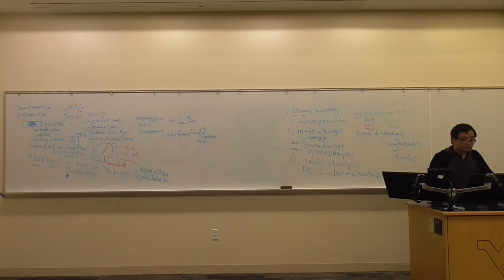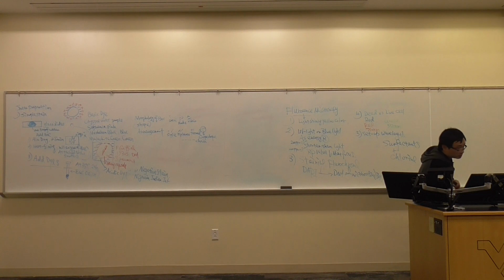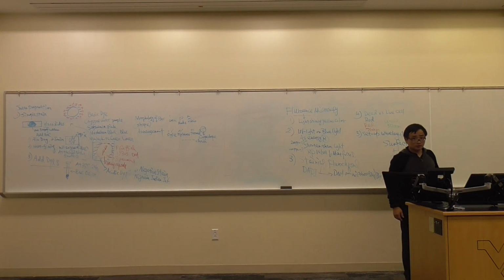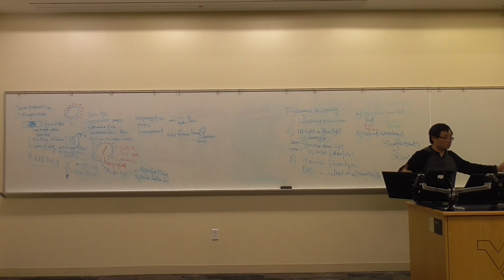And then, this is a very easy and obvious result for negative stain. This is Streptococcus pneumoniae. Look at how clear it is. Background is dark using Indian ink. You see the capsule there, and you see the diplococcus cell right in the middle. So if you see a patient that looks like that, community-acquired pneumonia, use antibiotics immediately, especially in the fall and winter season. So obvious, Streptococcus pneumoniae. We're going to talk about it in detail. It's going to be on the exam too, okay?